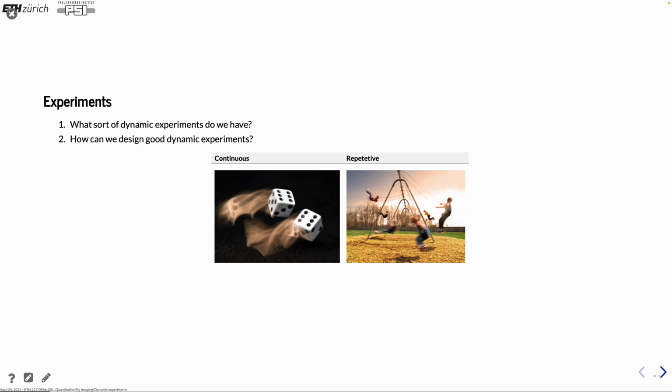And that is something you can use also in the acquisition, because then you can have some trigger point and restart the acquisition and accumulate, and in that way you can get more counts on your detector, and with that improve the signal to noise ratio. That you can't do in the continuous case. Then you have to just hope that you sample fast enough and that you get the signal to noise ratio that you need.